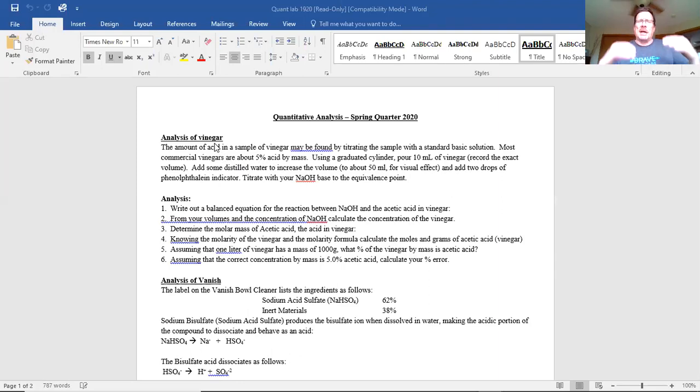for each area, say analysis of vinegar, break it all down, have a data table with all the data, which would be depending on the thing. Well, two things we know. The sodium hydroxide concentration was always 0.25 molar. Always. That's the sodium hydroxide only. And in the last two with the base, the hydrochloric acid concentration is always 0.10 molar.